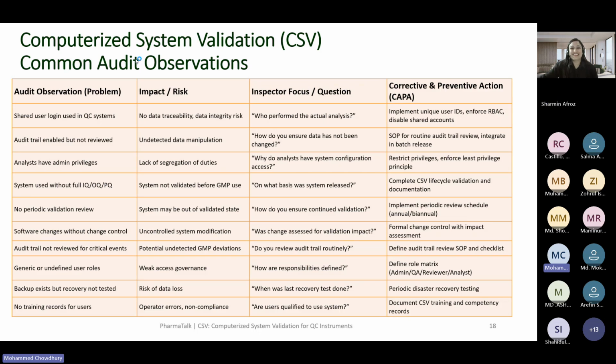But the thing is, QA can be the independent person. To check the audit trail, you should have the procedure for routine review. You can check the guideline from the FDA data integrity guideline. But the thing is, if you pay the third party, then the third party is not actually an independent person.